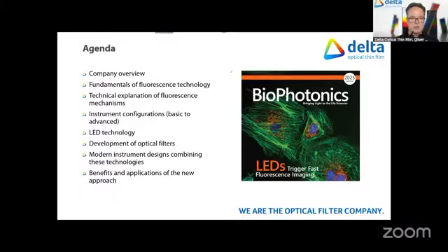Then I will say a few words about the development of optical filters and then how that combination is used in modern instruments, designing these technologies, and what the benefits and applications could be. Because we do not have so much time, I will share two resources in the chat for you to watch another recording and also to read the article that I show here on the screen. There are a lot more details than we have time for today.